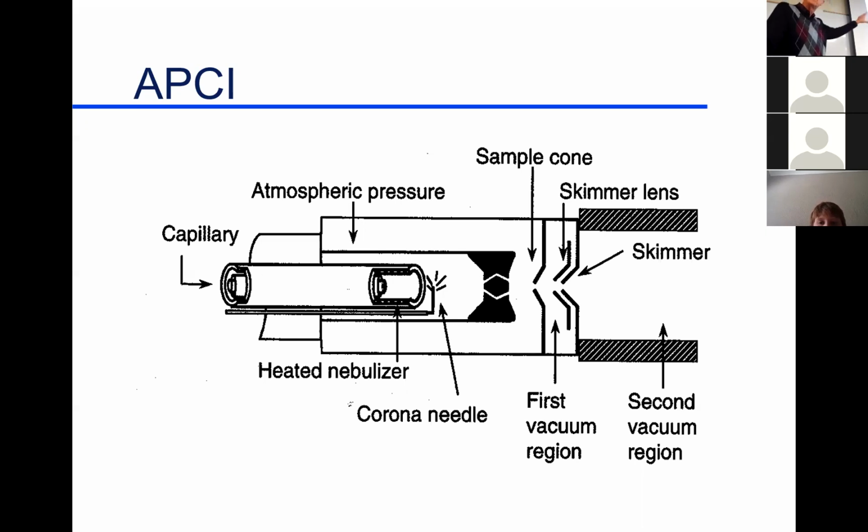This type of mass spectrometer would be up in a balloon, for example, in the atmosphere, monitoring pollution or following buses through a metropolitan area. So it would be looking at air pollution as one example. I look at it for flavor compounds that are in the air that we smell. But in this particular system, we've got a capillary inlet that's forcing some gas or sampling some gas in it.